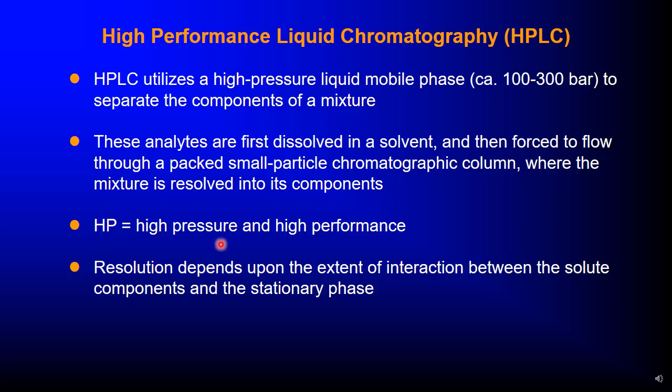High pressure and high performance, that is the meaning of HP. The resolution depends upon the extent of interaction between the solute components and the stationary phase.